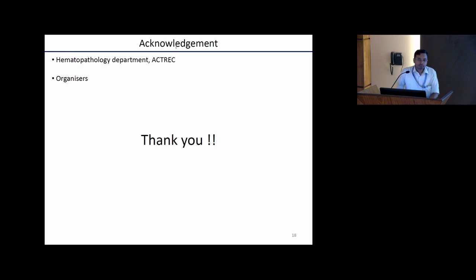For the CNV analysis, let's say some samples, due to some kind of error in the sequencing, or we don't control the sequencer, like you do the library and then you send it out. So instead of 1 GB data, you get somewhere around 2 GB data or 1.5 GB data. So during that time, can we subsample? So we'll have a full talk on CNV. Okay. On the mode of how we do it. Thank you.